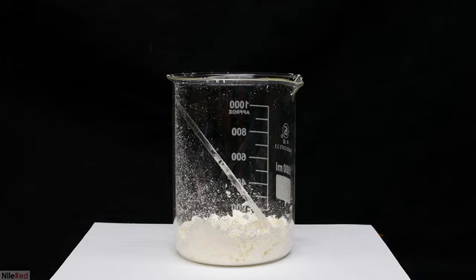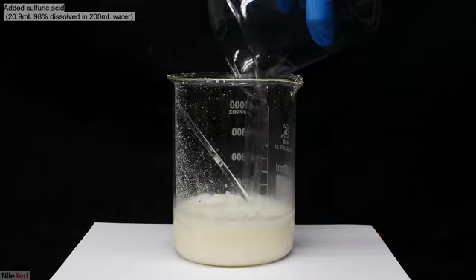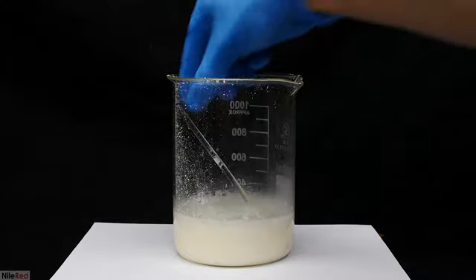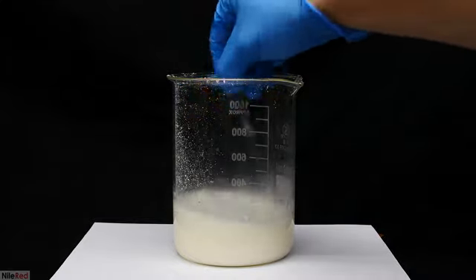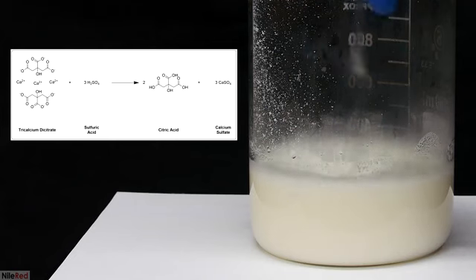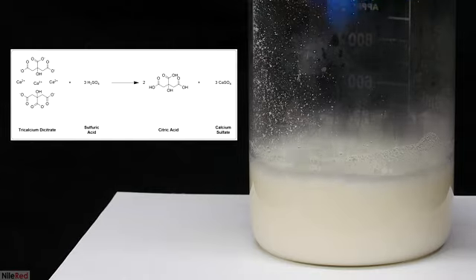All of the calcium citrate is then transferred to a beaker, and I pour in some sulfuric acid. It's important to note that the sulfuric acid I'm using here is not concentrated, and it's pretty heavily diluted in water. Anyway, once it was added, I used the glass stir rod to thoroughly mix everything together. In this reaction, we're converting the calcium citrate back to citric acid. Citric acid readily dissolves into the water, but the calcium sulfate that we produce is really insoluble.